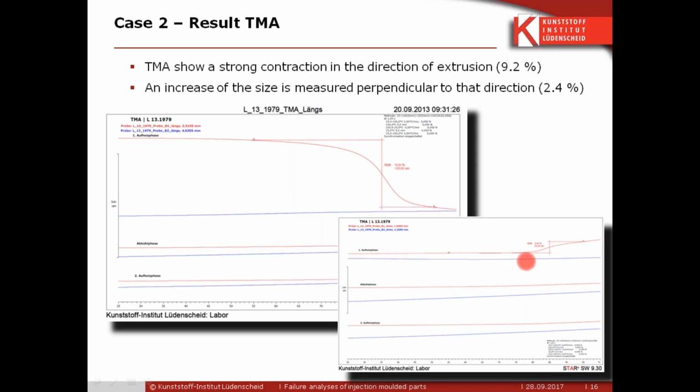You can also measure films and fibers by TMA, then you won't use this standard sample holder, but there are many other sample holders to measure such things. Okay, let's directly jump to the results.